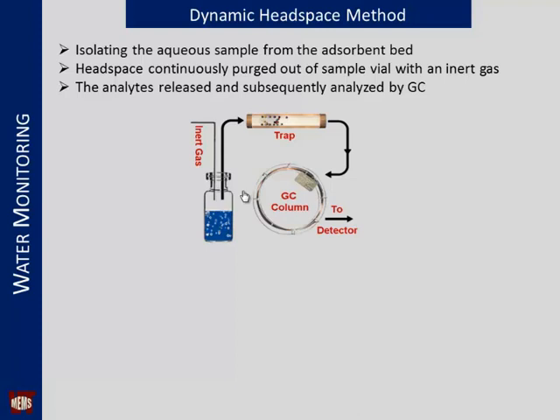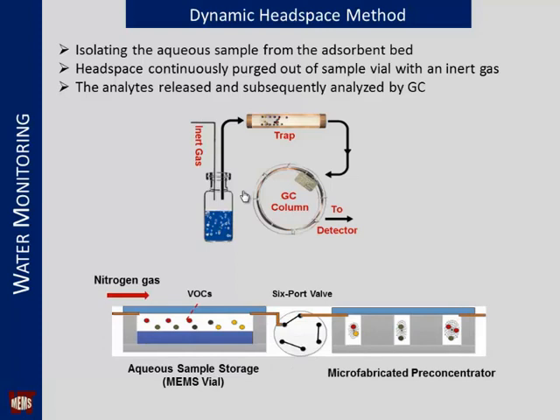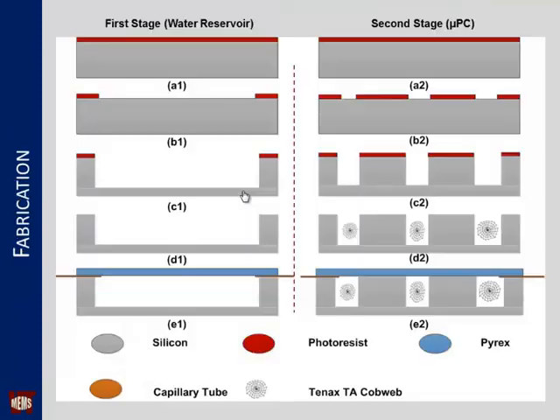So it's basically a two-stage approach. One is the extraction of VOCs out of water, and the second stage is the release of those extracted VOCs from the microtrap for gas chromatography analysis. So this is the MEMS-based approach that we have, and this is the first time we're presenting it. We use a chip which is partially filled with water, and the VOCs again equilibrate between the gas phase and the liquid phase. Then we push nitrogen gas through, and they go through the microfabricated preconcentrator that I just showed you. This is similar to the dynamic headspace technique that you see here.